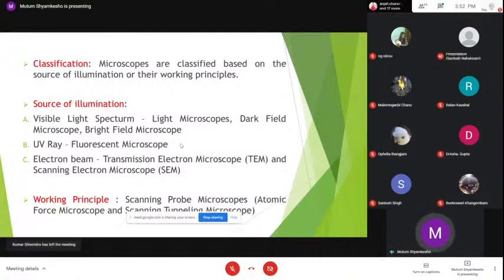In the case of the scanning electron microscope, the name scanning is given because a very fine electron beam, known as the electron probe, scans the surface of the object or specimen in a raster manner, usually performed by using a scanning coil.